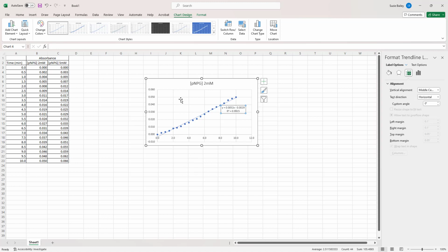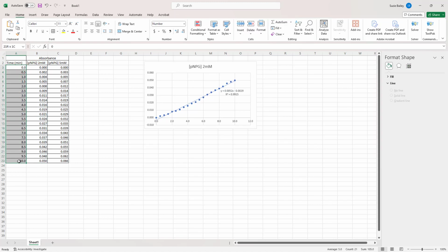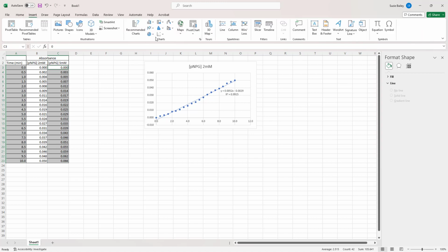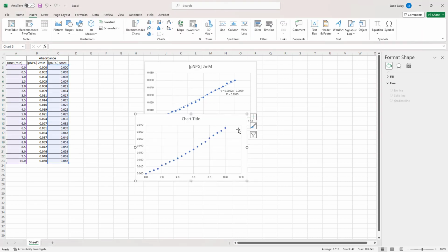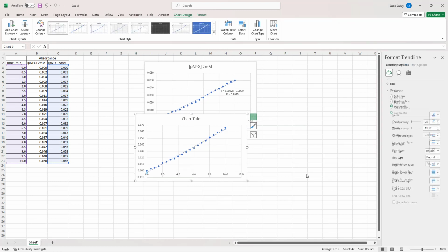Now, you can do your graphs individually, one at a time. So selecting your time data, and by holding down the control key and then clicking and dragging to select the second set of data, follow the same steps, go up here to Insert, choose XY scatter, come over here to the little plus sign, tell Excel we want it to give us a linear regression, we want it to draw us a trend line.